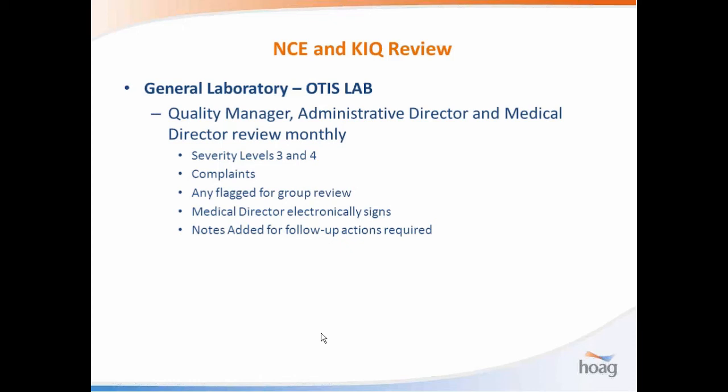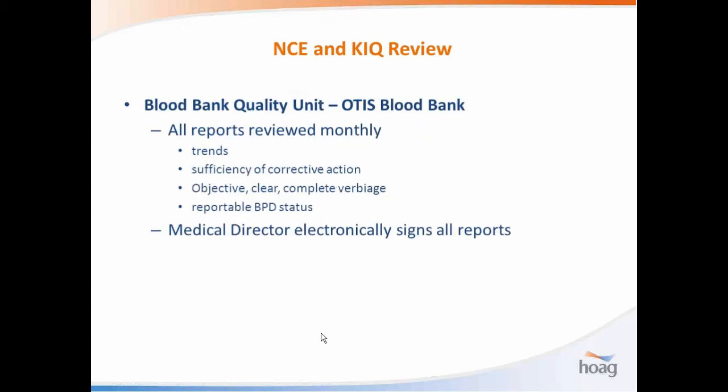The medical director then electronically signs those, and you have the ability to add a note to an OTIS report, and if I have time I can demonstrate that. So if during our review we want some additional follow-up or actions, we'll add a note to it, and that will flag the reviewer in that section to take some more action.